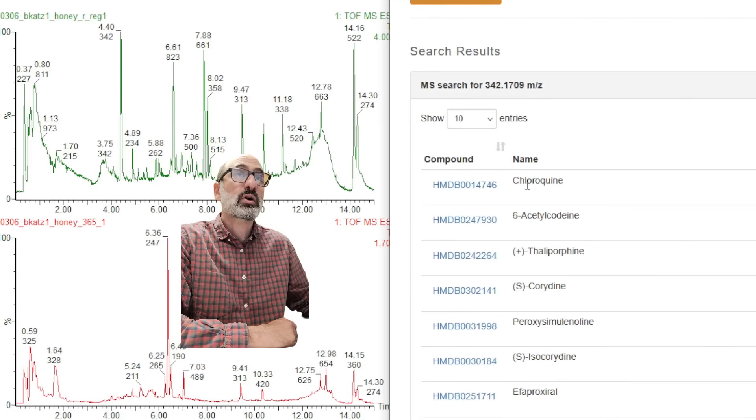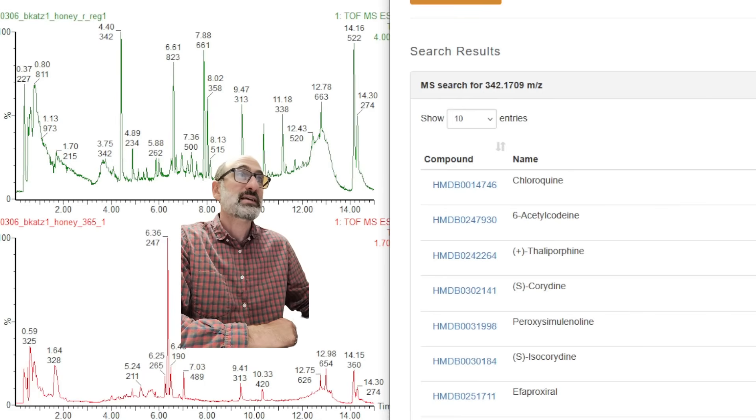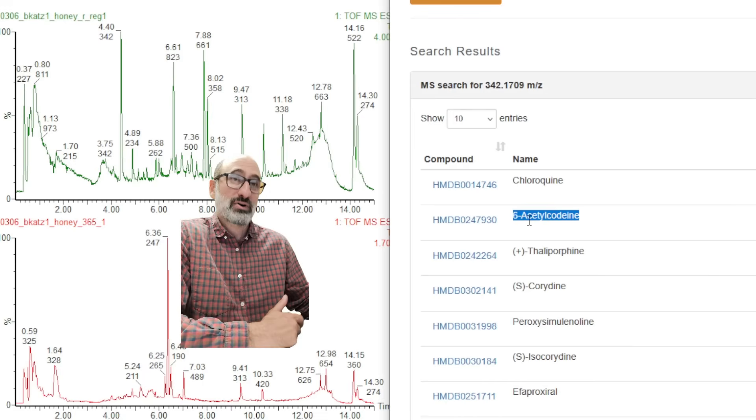Searching it in HMDB, we're getting this chloroquine, which is sodium, but we know the peak from the way it looks. And the mass spectra is not sodium. The next top hit is 6-acetyl-codeine, which would have some effect, noticeable effects.